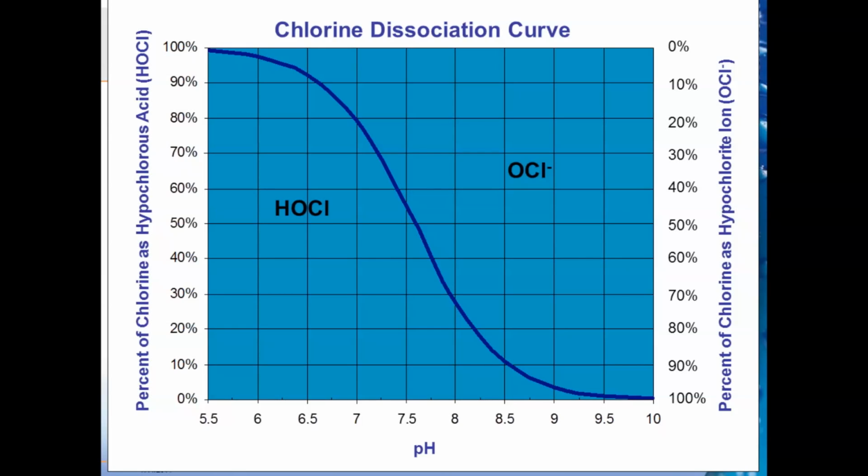Some people are adamant about not changing the pH of their process. In fact, they want the pH to be higher. They say that they're concerned with corrosion in their system. So with that said, we just have to make them aware that the colorimetric test kit that they're using not only reacts because of the reagent in there, but it also buffers the sample. So where we might be at 8.5, the target is actually about 6.7, 6.5, depending on the manufacturer. So it tries to lower the pH there, and you can see how much HOCl is there at 7 or 6.5 on the pH side. So it's much more efficient. It looks to be much more efficient, I should say.